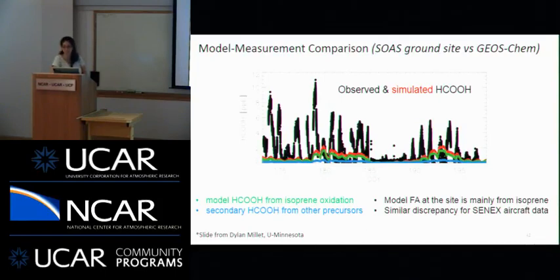Do you have these mass defect plots also for that instrument? Not yet, but from the CalTech FIXCIT data, Pavel Misztal ran the same set of reagent ions. So that data is apparently on its way to us to get processed to be put on the mass defect plots. And I'm pretty excited to see what that shows.